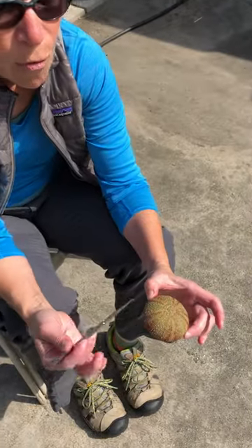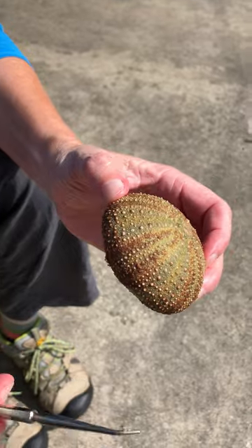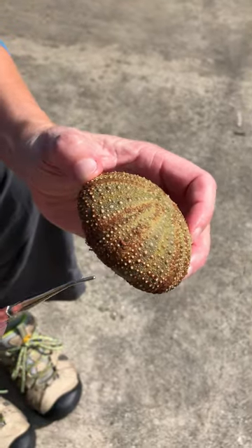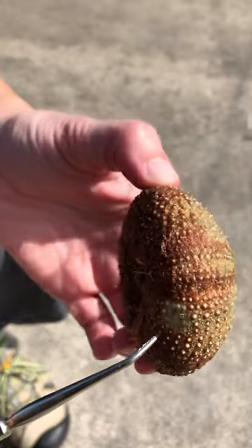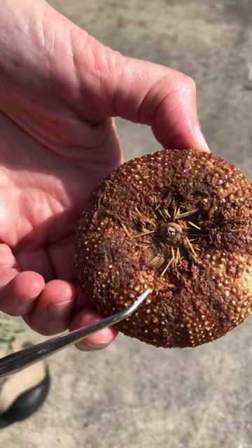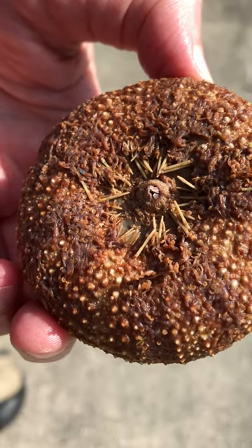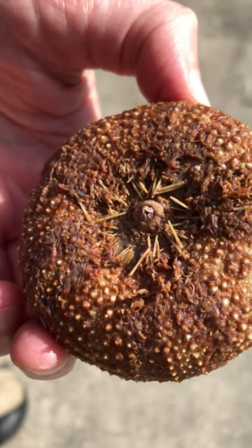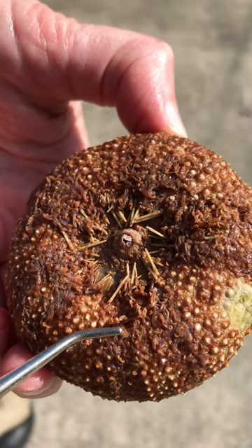Let's have a look at the external anatomy of the sea urchin. This specimen has been in pickle juice for quite a while, so it doesn't really look like a normal sea urchin anymore. The spines that would be prevalent are all but gone — we just have some here on the oral side — and the tube feet that would be prevalent have mostly either retracted or decayed.